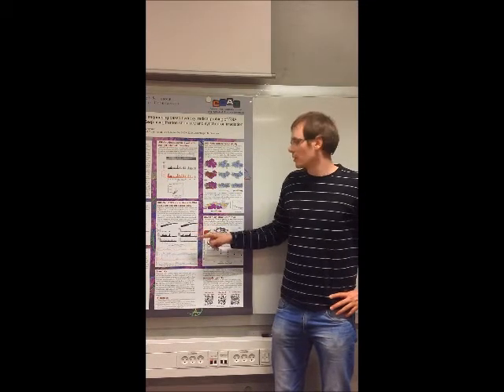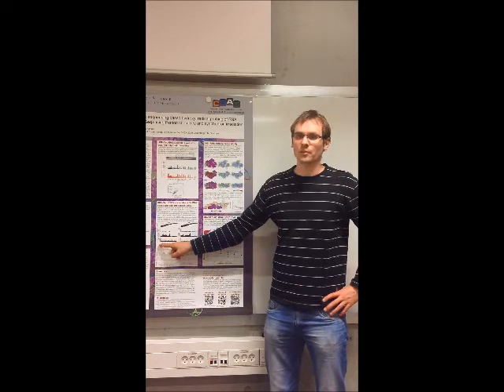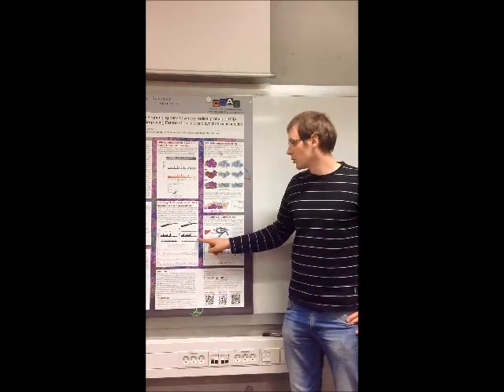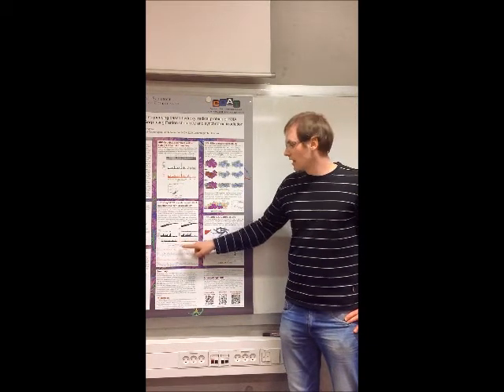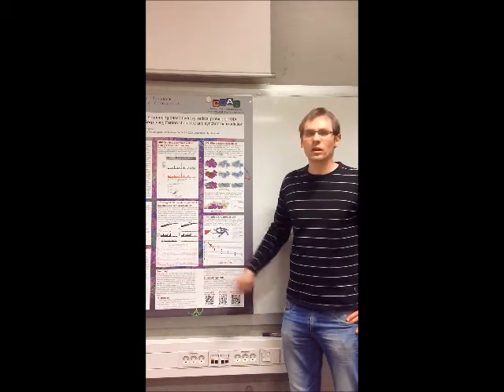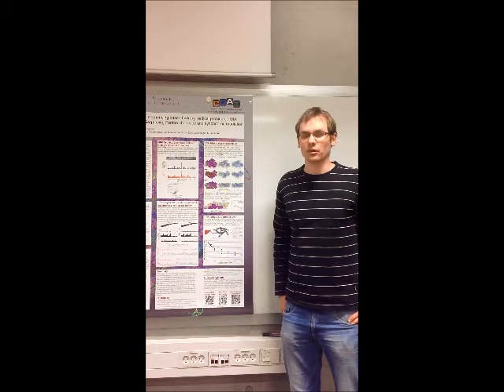The ratio between termination and coverage is called termination coverage ratio, TCR. TCR of the control sample is subtracted from TCR of the treated sample and yields delta TCR, which correlates well with RNA backbone accessibility as measured from the known crystal structure.